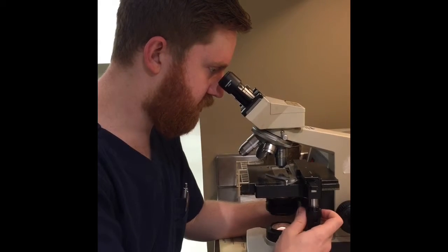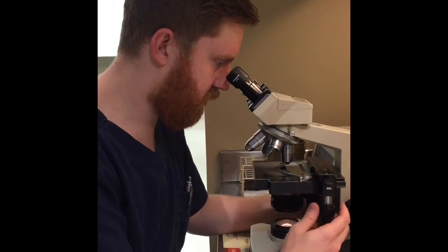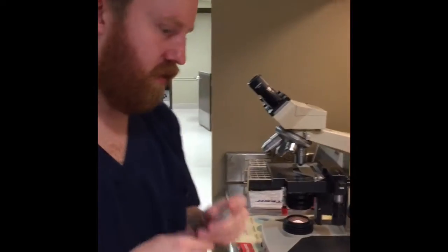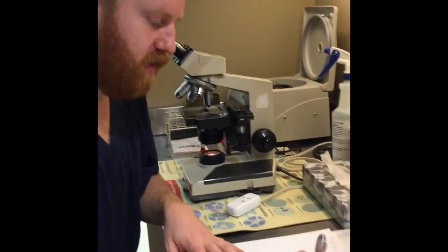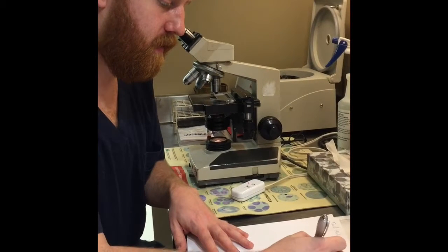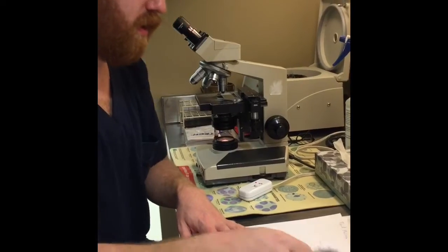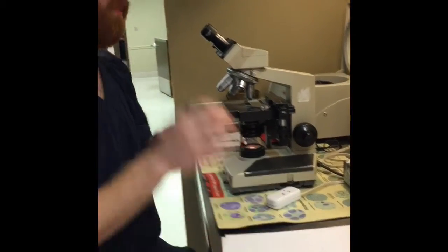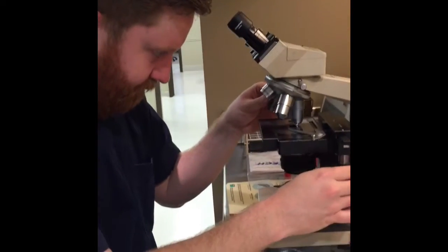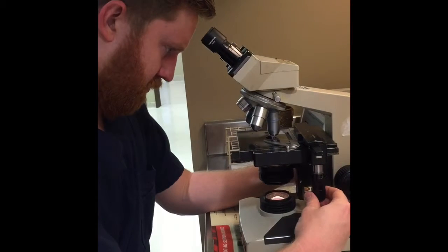Okay, and I'm approaching the end of my slide here, and I have not seen any crystals. I haven't seen any type of cast, no granular cast or anything. So I'm going to go ahead and chart that we didn't see any cast or crystals. And then I'm going to take a look for red blood cells and white blood cells by going up to 40x, and just covering the entire slide once again.